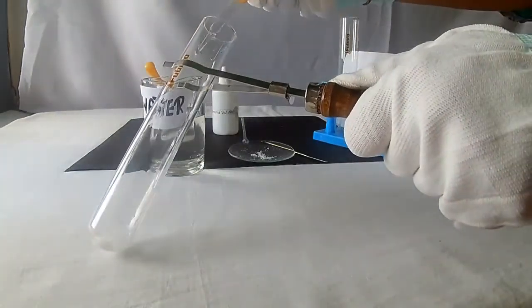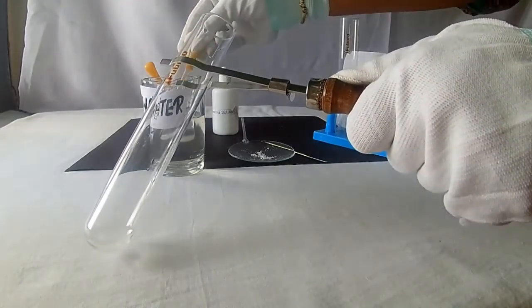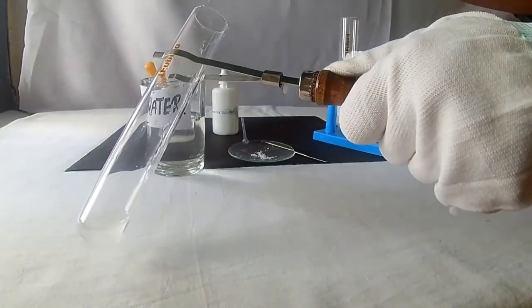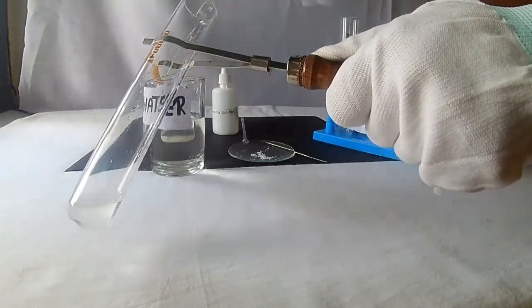To prepare the solution of the salt, add water to the salt. We can see that the salt dissolves in water.